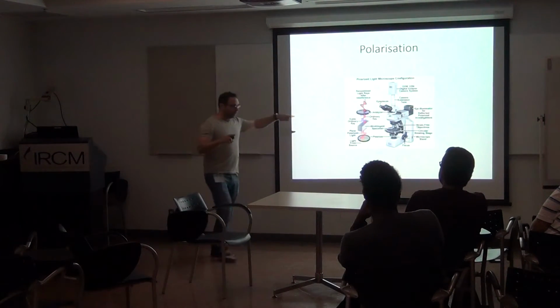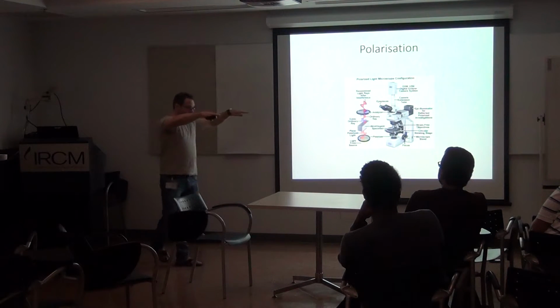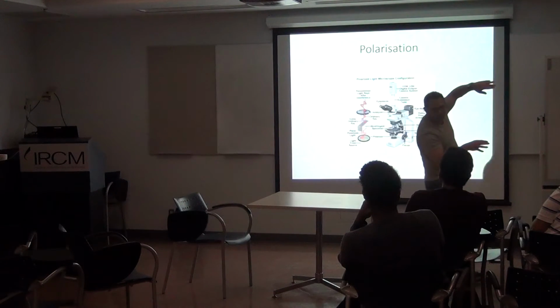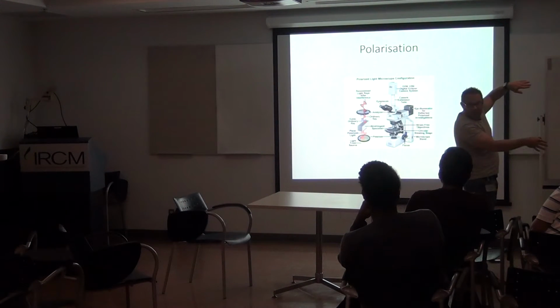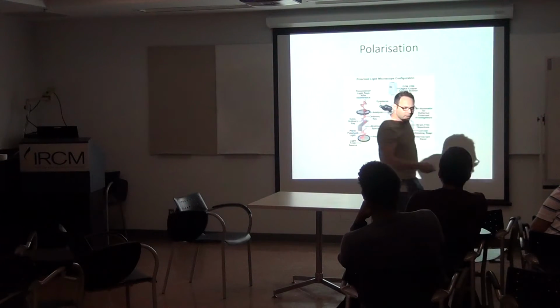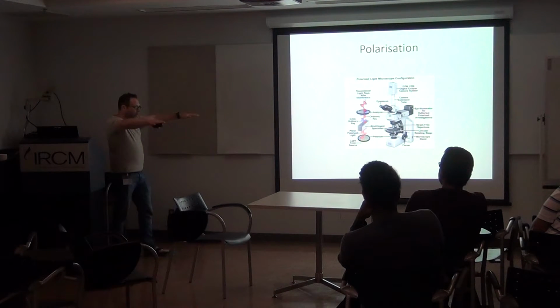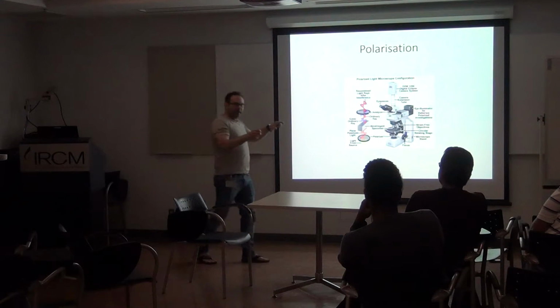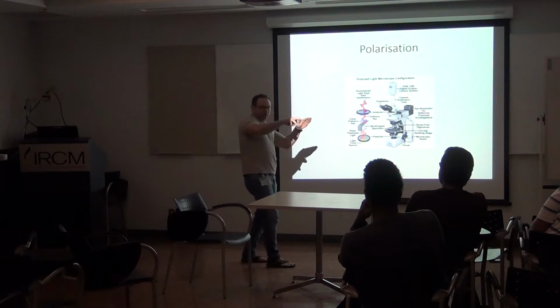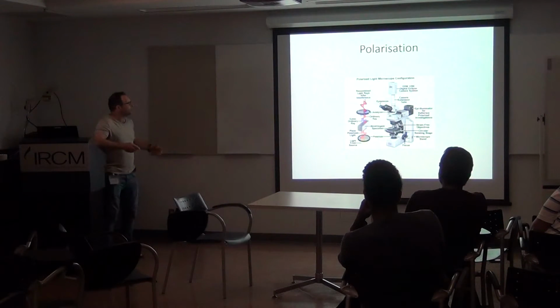Okay? Except if you have a specimen that is birefringent, light is going to go like this. It enters into that specimen, it's going to go into another direction, and when it hits the other polarizer, it will go through, and then you're going to see some light. Okay? So that's how this technique works. So you use polarized light in one direction, and you expect to see your specimen where it may turn the polarization, so that you see where your specimen is.